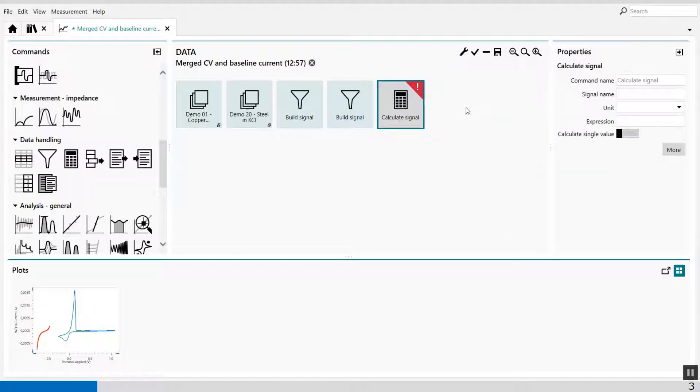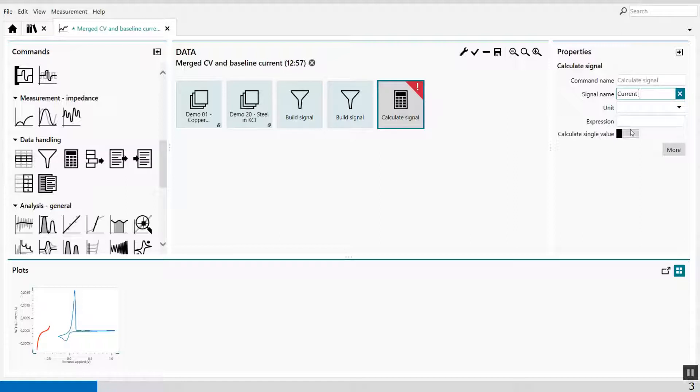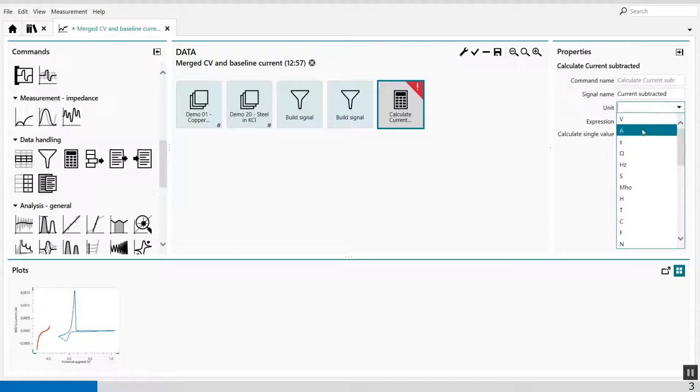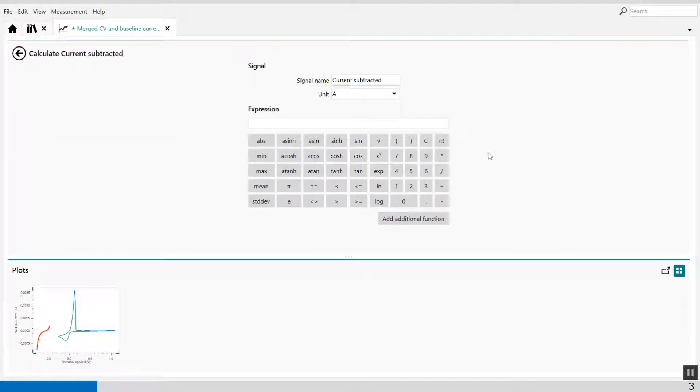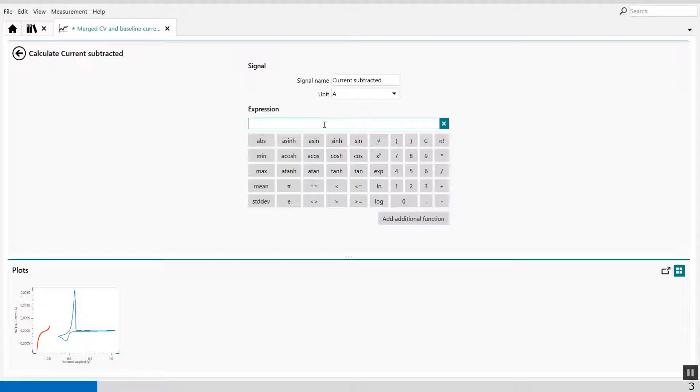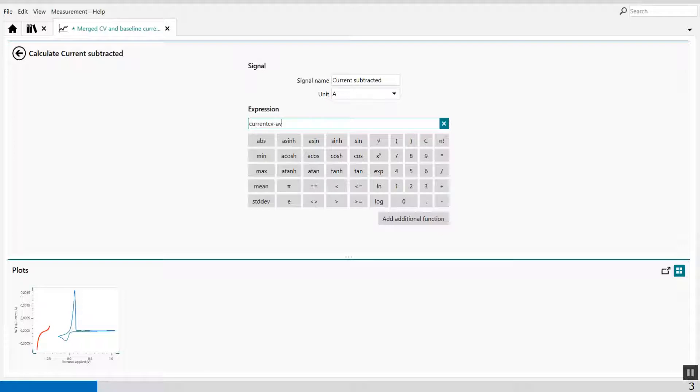And that's done in the calculator. Current subtracted. Like this. Unit amps. And I can give it a... So I want to subtract the average current of the LSV from the CV. So I say current CV minus average current LSV.